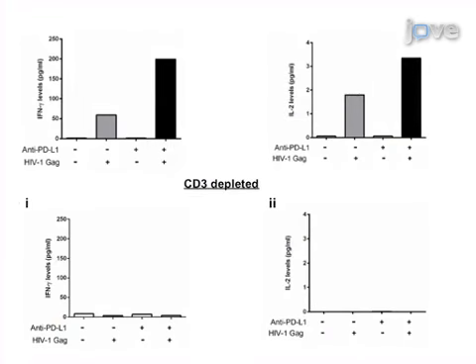Results on cytokine secretion, phenotypic, or transcriptional analyses can show the impact of antibody blockade of inhibitory pathways on restoring the effector function of HIV-specific CD4 T cells. This in vitro assay can be effectively used to quantify cytokine levels restored by the blockade of inhibitory pathways, to investigate a broad panel of effector molecules, and also to evaluate the impact of cytokines produced by HIV-specific CD4 T cells on other cell subsets.